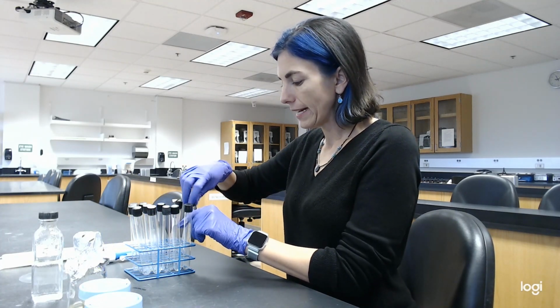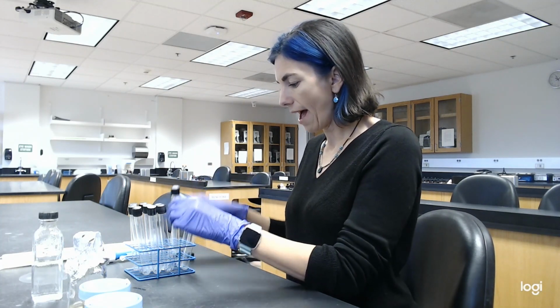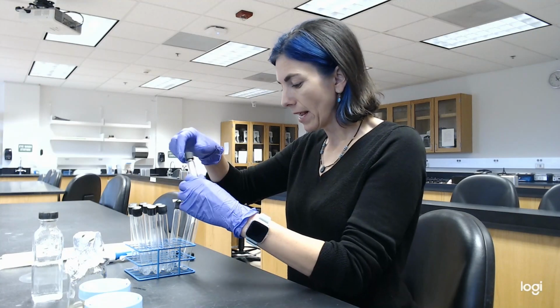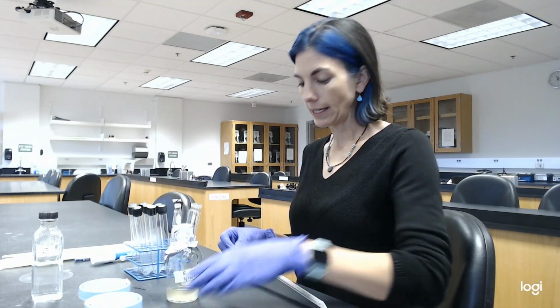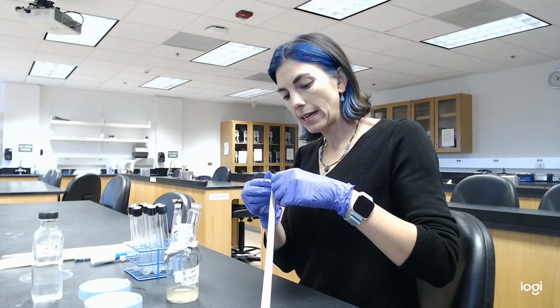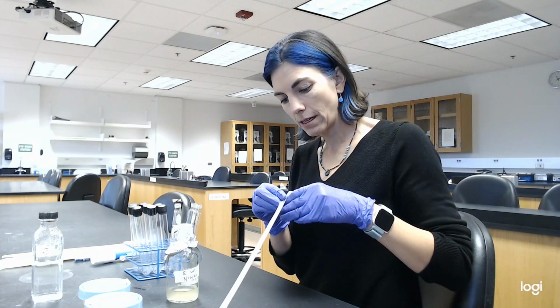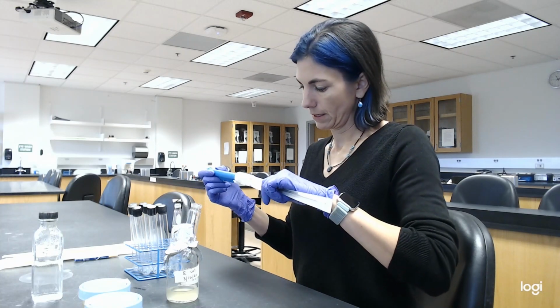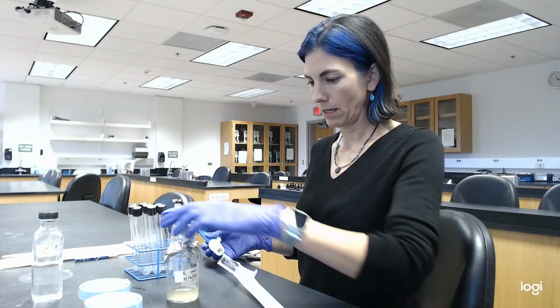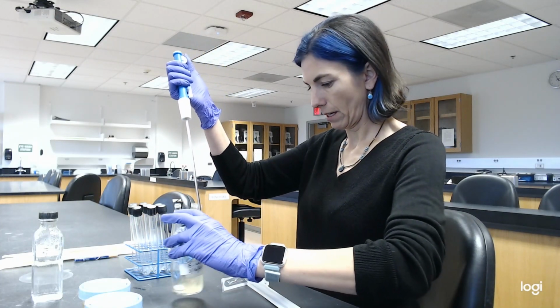All right, to each of these, I'm going to add about half a milliliter of E. coli. Now I'm going to use the same broth for each sample. The reason why I'm picking the same broth is so that I can ensure that the starting concentrations are pretty consistent. Mix it up a little bit first.